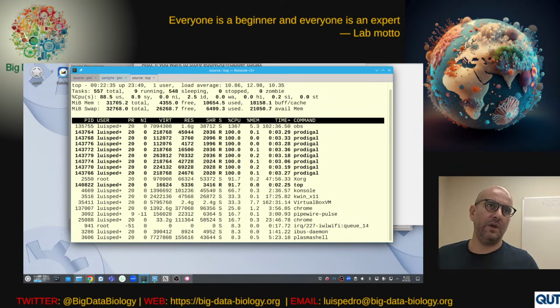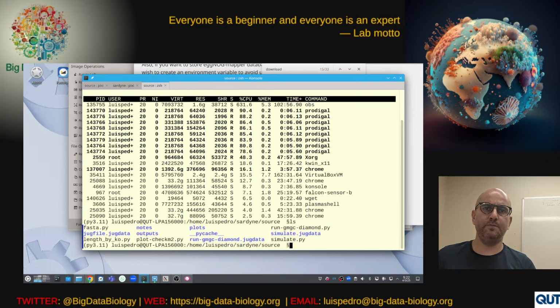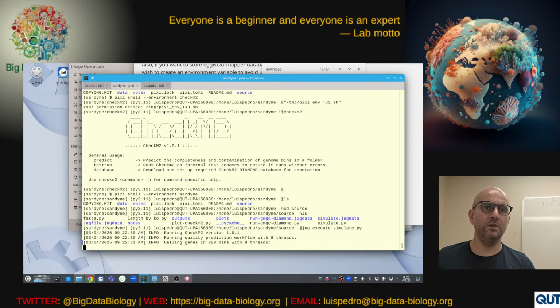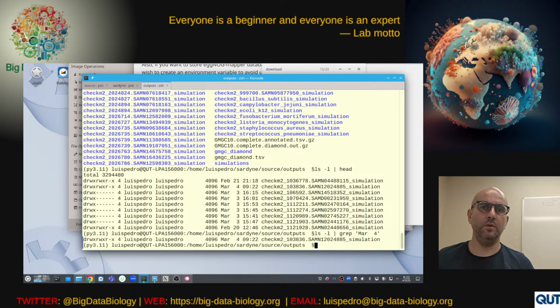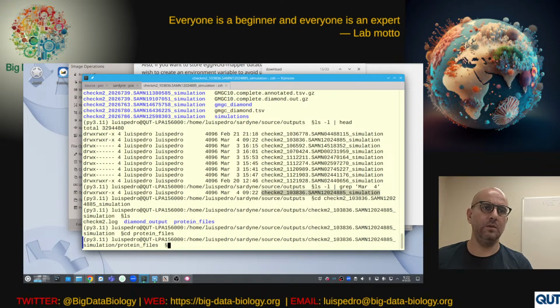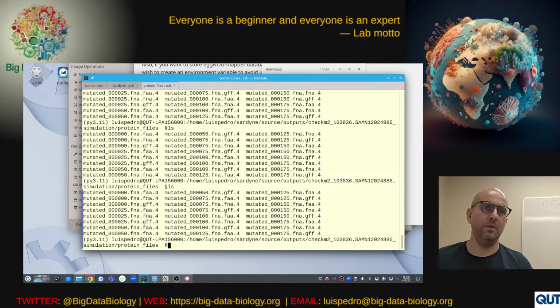All right, so we're generating all of these genes. Just checking, it's this one.